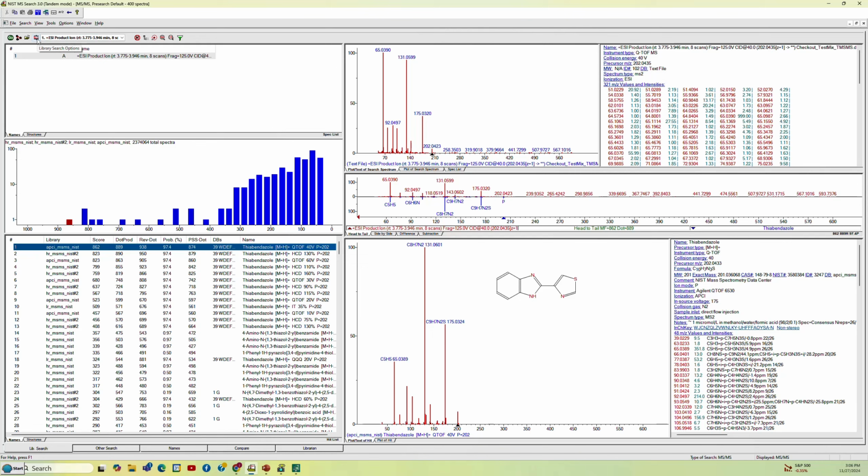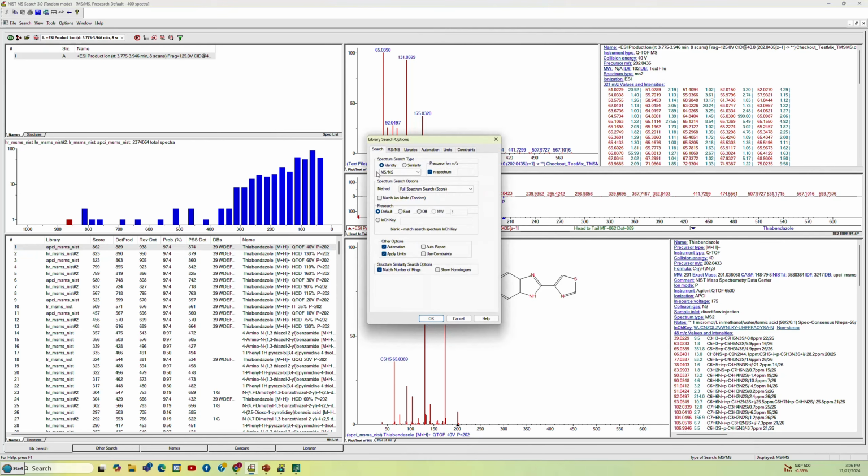Of course, in the documentation, it talks about the setup. This was for the MSMS search. This is for a search where it limits the search by the precursor. If you'll notice up here in the top part of the display, you'll see that the precursor mass to charge was imported with the spectrum. And so this is a really very specific way to search that limits things. So that's usually the one that I would do first.